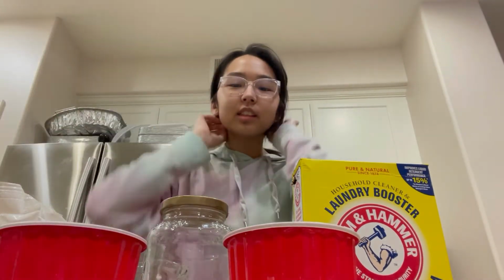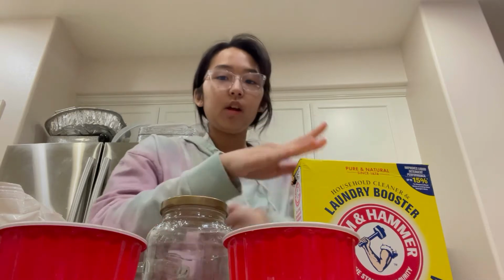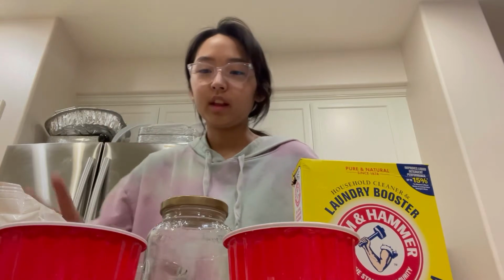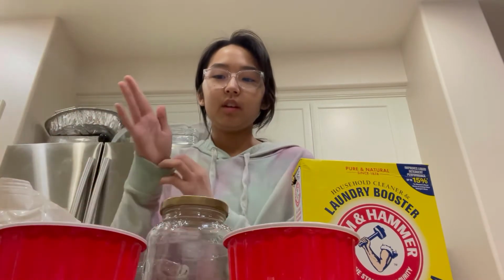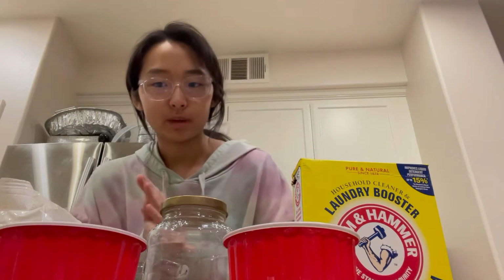Okay, so in front of me I have 2 different ingredients. I have washing soda, also known as sodium carbonate, which is Na2CO3, and then we also have Epsom salt, which is magnesium sulfate, MgSO4. So what are we going to do with these? Well, I'm going to make a precipitate.